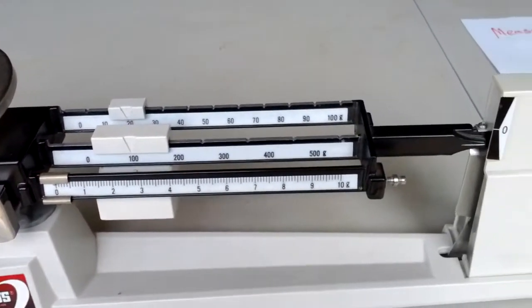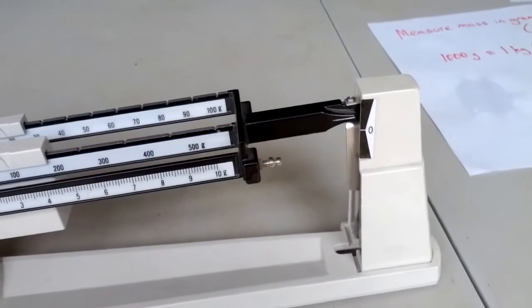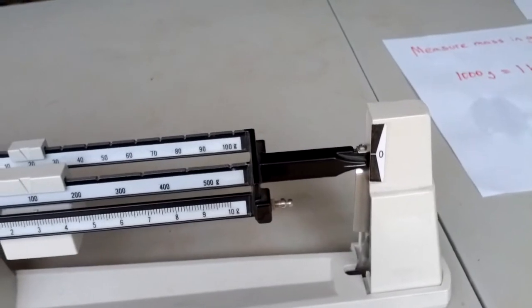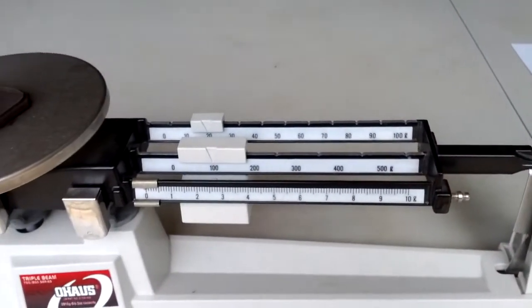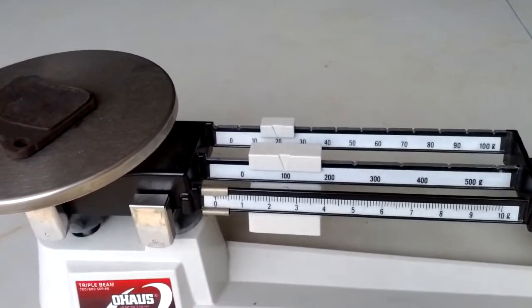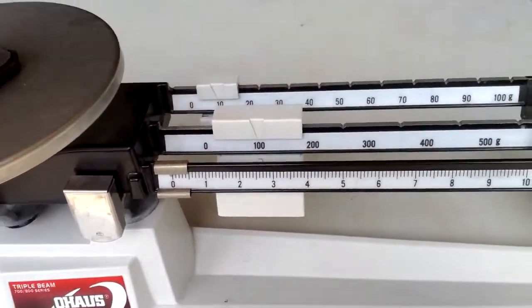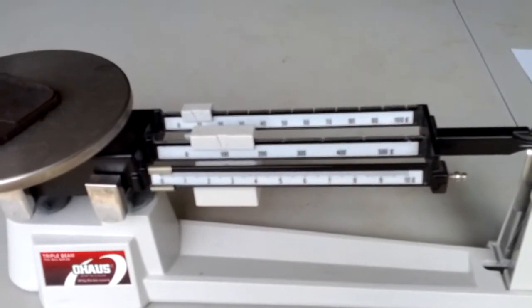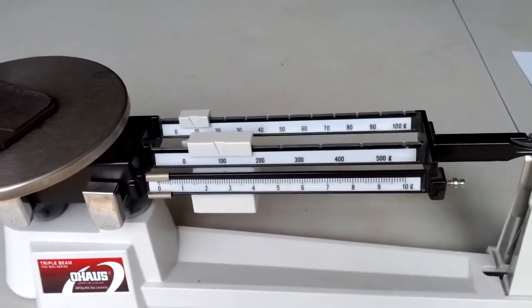So now I need to slide it over one more notch to the 20s. And I'm too far. Because now it's going all the way down. So 120 grams is too much. It has less mass than that. So I need to go back to the 10. So now we know that it has a mass of at least 110 grams.